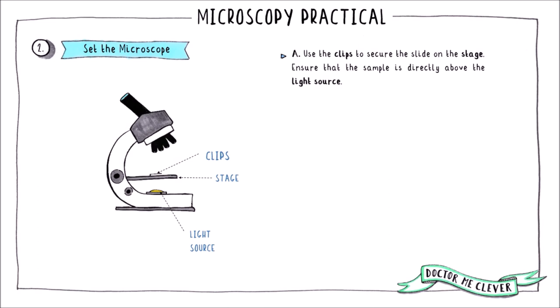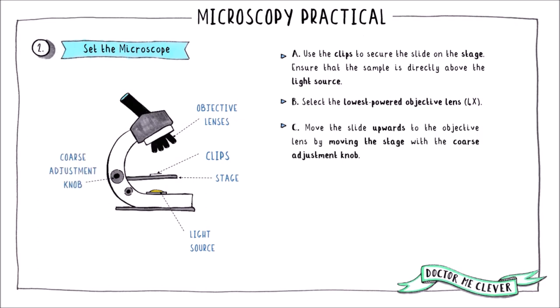First, use the clips to secure your slide on the stage. Ensure that the sample is central over the light source — the light has to pass through your sample in order to magnify it. Next, select the lowest powered objective lens by turning the carousel of lenses until the lowest powered lens is directly above your sample. This lens usually has a magnification power of four times.